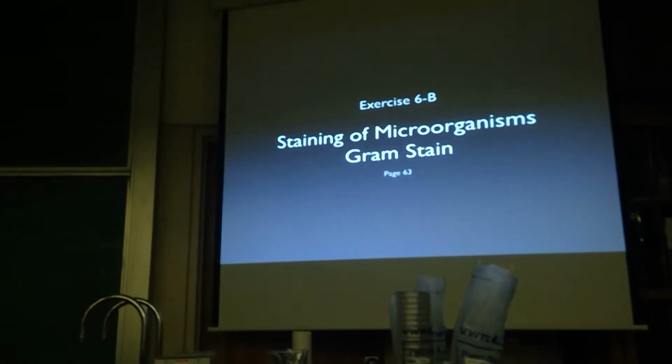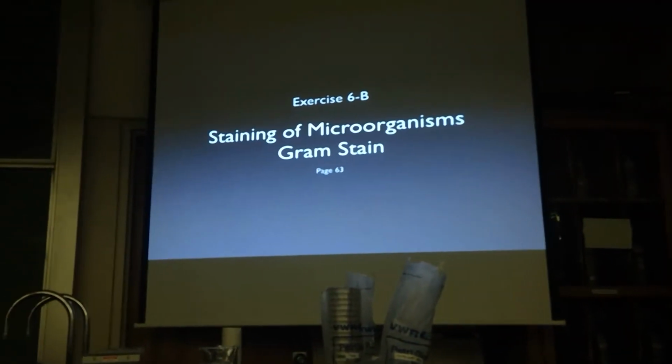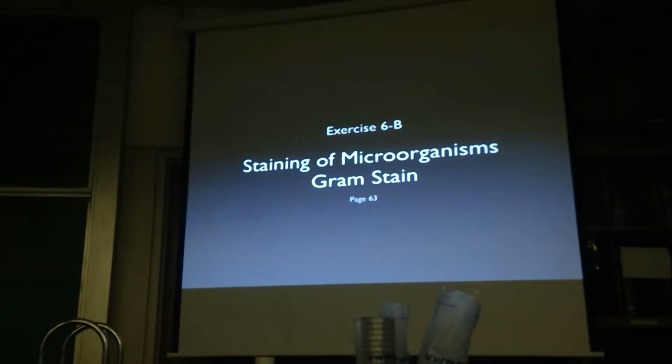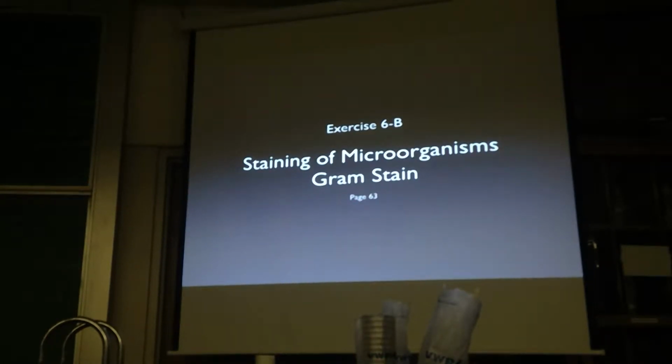So last time we began our staining operation, we did a direct stain and an indirect stain, but you didn't get to look at either one of them. Hopefully you guys got them all put together. Tonight we're going to do the gram stain, and then you will have time to look over these because it's not quite 8:30. We go until 10:05. You should have plenty of time.